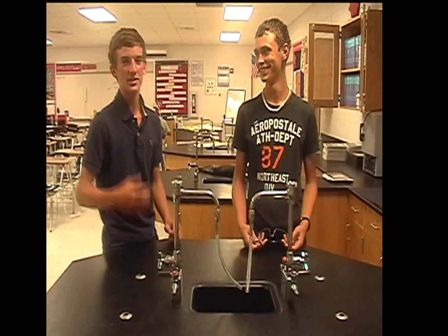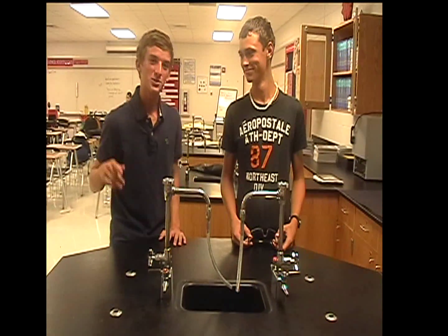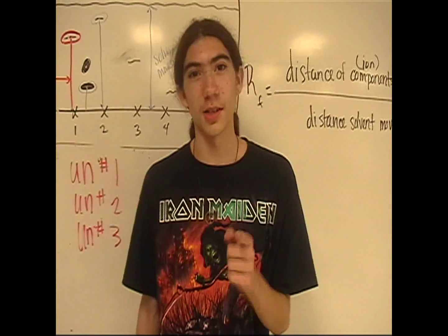Alright, hey everybody — Nickel and Jmac here. We're gonna teach you some chemical safety in the lab. First we're gonna show you what not to do, and then we're gonna tell you how to handle that.